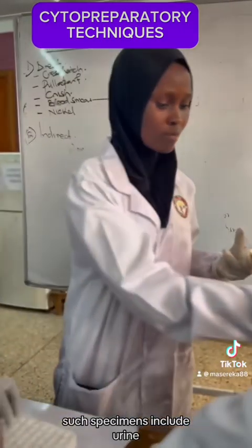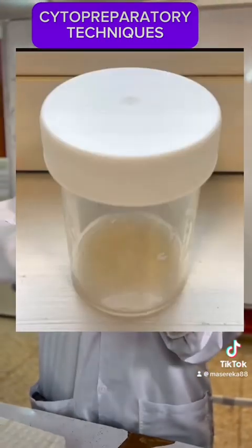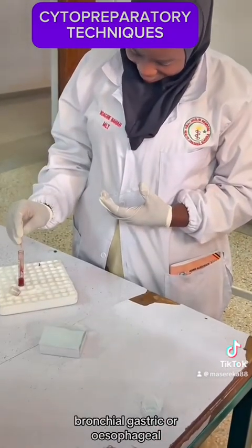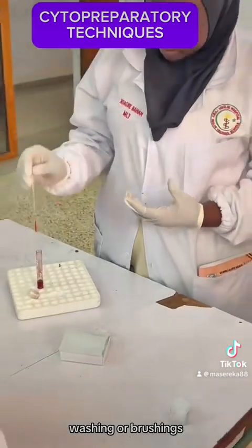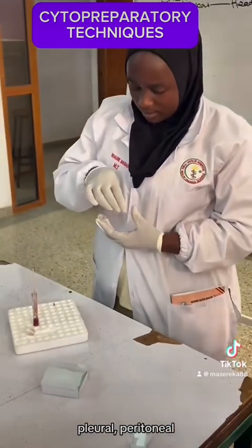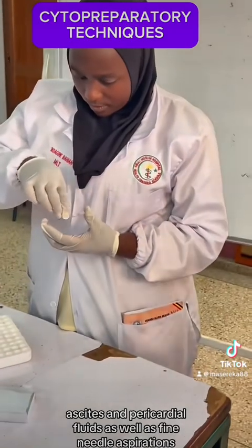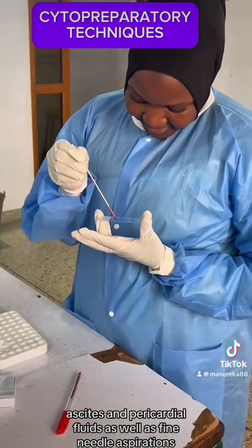Such specimens include urine, sputum, cerebrospinal fluid, bronchial, gastric, or esophageal washings or brushings, pleural, peritoneal, ascites, and pericardial fluids, as well as fine needle aspirations.